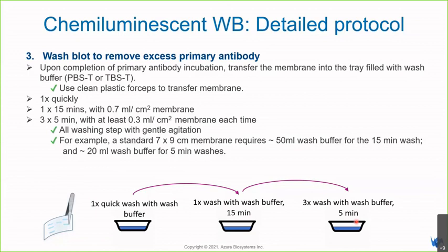These steps make sure that the membranes are rinsed uniformly to remove the majority of the excess primary antibody incubation solution. However, the agitation must be done gently, softly, to prevent any scratches or damage to the surface of the membrane. Any scratches or damage to the blot surface will create a lot of active sites that can absorb the secondary antibodies and give you artifacts or high background.